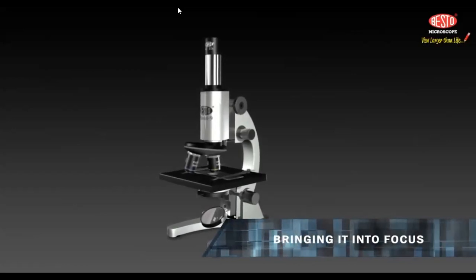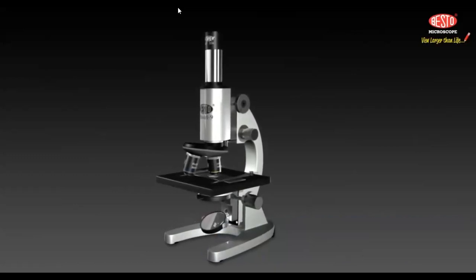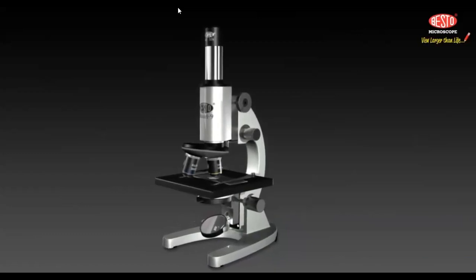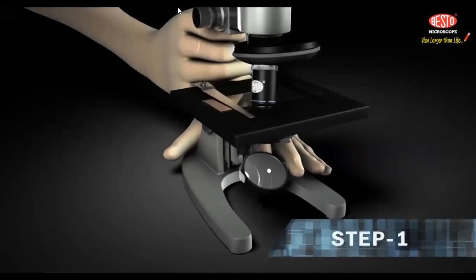You're probably anxious to get started using your microscope. Before you use your microscope, you need to know how to set it up properly. This video contains instructions for you to follow. You should come back to it each time you use your microscope until you know the instructions by heart, as well as the microscope.